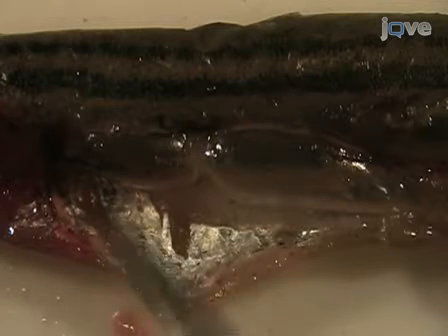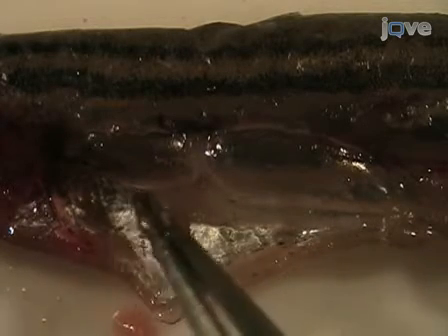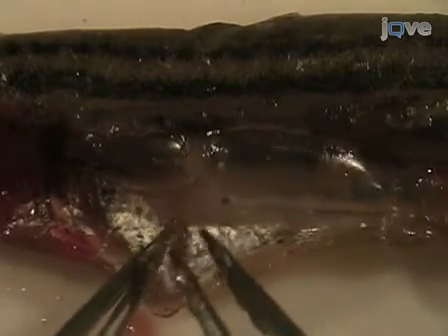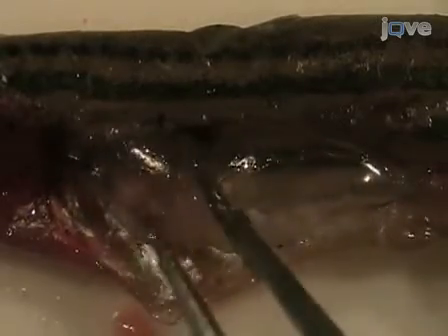Now examine the swim bladder. The swim bladder consists of a posterior chamber, which is connected to the esophagus via the pneumatic duct, and an anterior chamber, which is connected to the inner ear through the Weberian apparatus. Remove and discard the swim bladder.